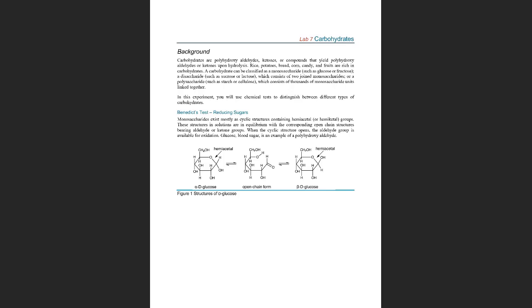So let's share now the page of the experiment. So we said that the first test that we are going to do is the Benedict's test.